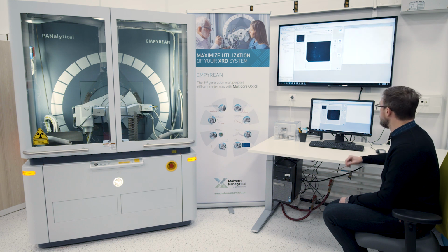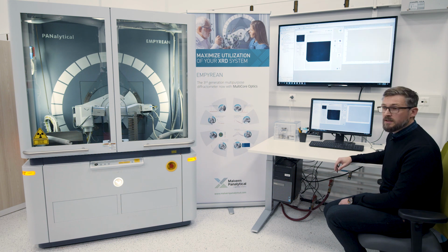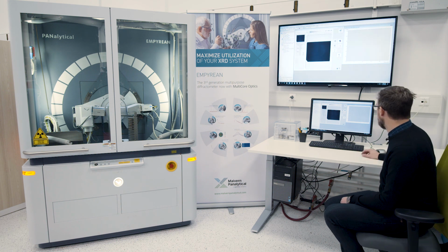With that, I will just leave the setup to itself. And once the data is collected, I will be back to discuss the results with you.